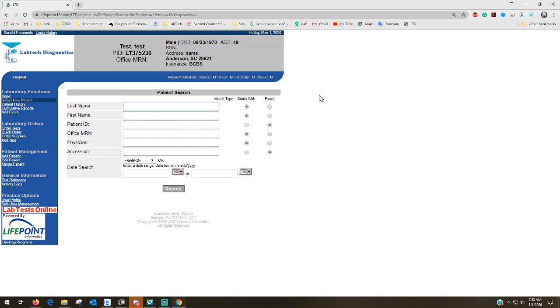And that's basically it. All we require on the tubes is last name, first name, and date of birth. If you are going to be using a label printer to print these off, we can do that. There are some requirements for that and some software that we have to add or that you can add to it. If you give me a call, I can help you with that. If they like these videos, I'll try to print one off to make it a little bit easier. But the only way the label printers that we send out will work is if your browser is on Internet Explorer, and that's just because the driver's there.